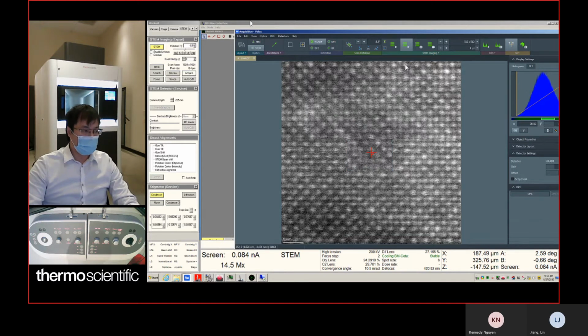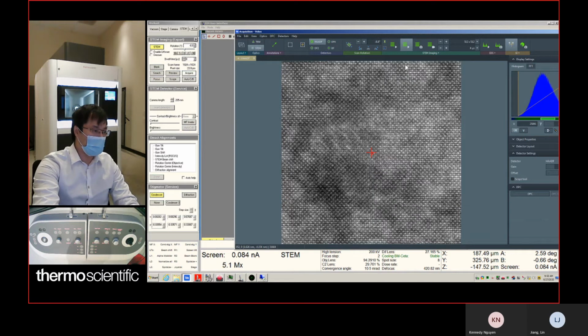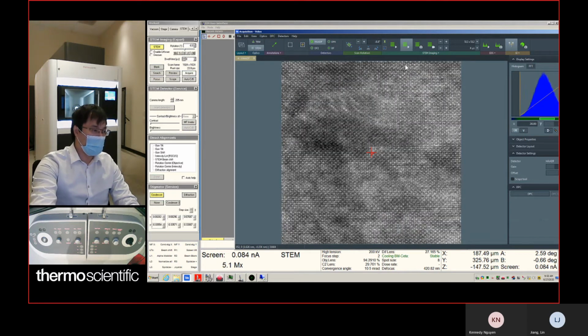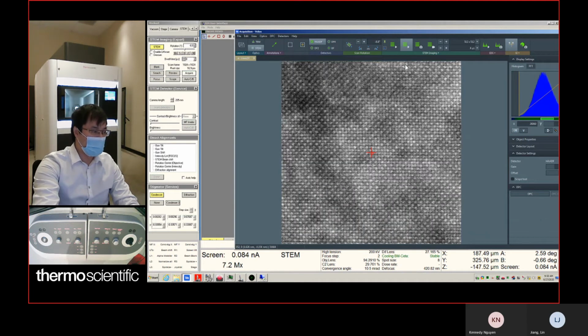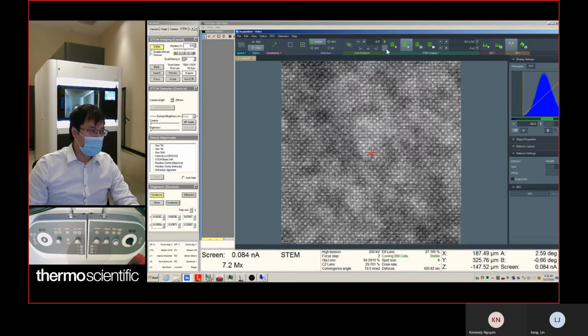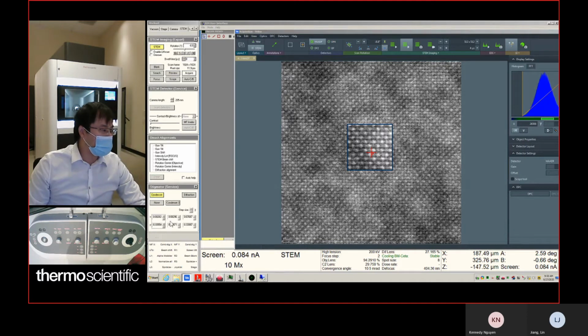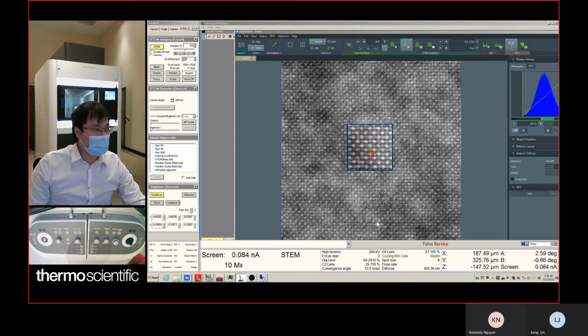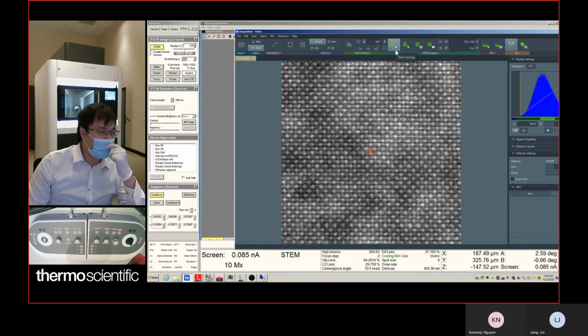Okay. Let's move a little bit. Go to a magnification of at least 5 million.